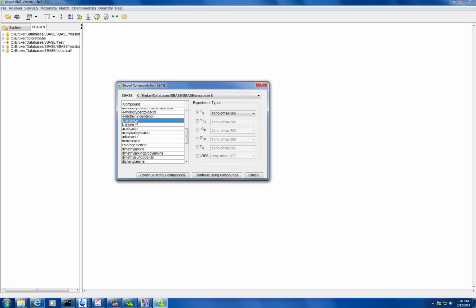This one? Yeah. So you can click, with your other hand, press Control, so you can click multiple samples. So you can have arginine, and right below it there was lysine. So if you go back up, lysine, perfect. And what else is in there? There's DSS. So let's see if there's DSS. Oh, there's water, so we can click on water. There's DSS and TSS.